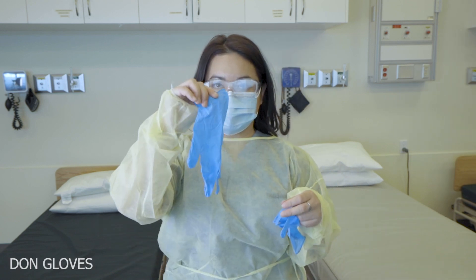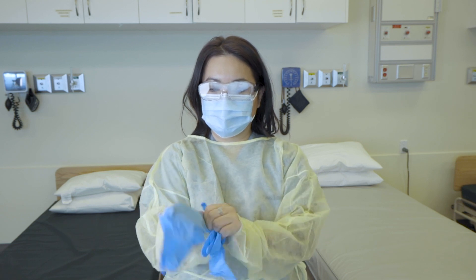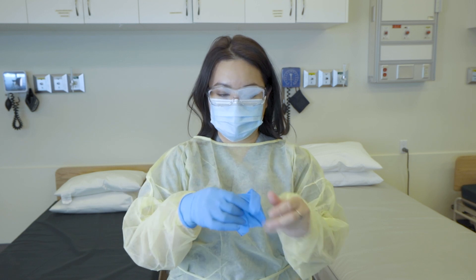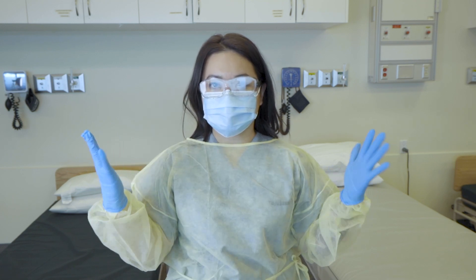We would then put on our clean gloves at this point. We just want to make sure that our cuffs are tucked inside the glove just for extra added protection. And there you have it.